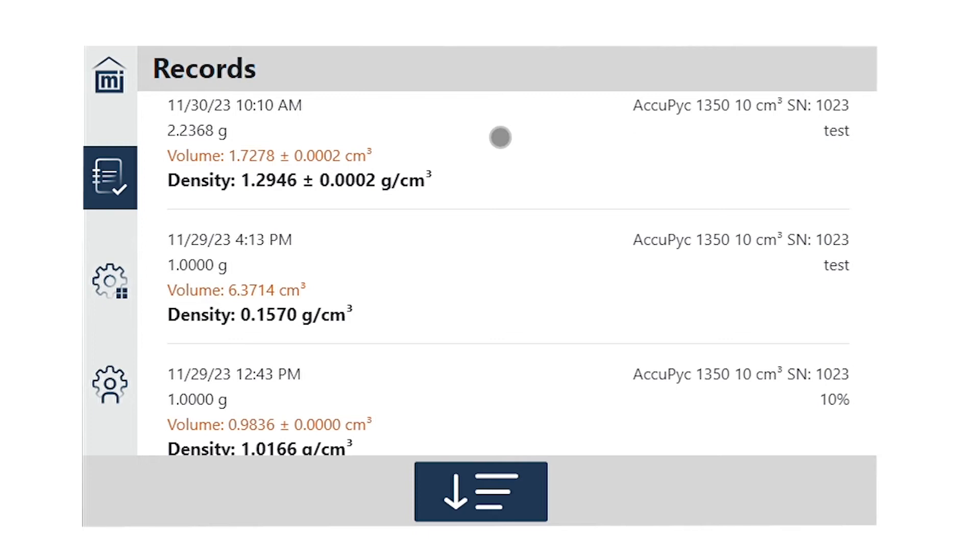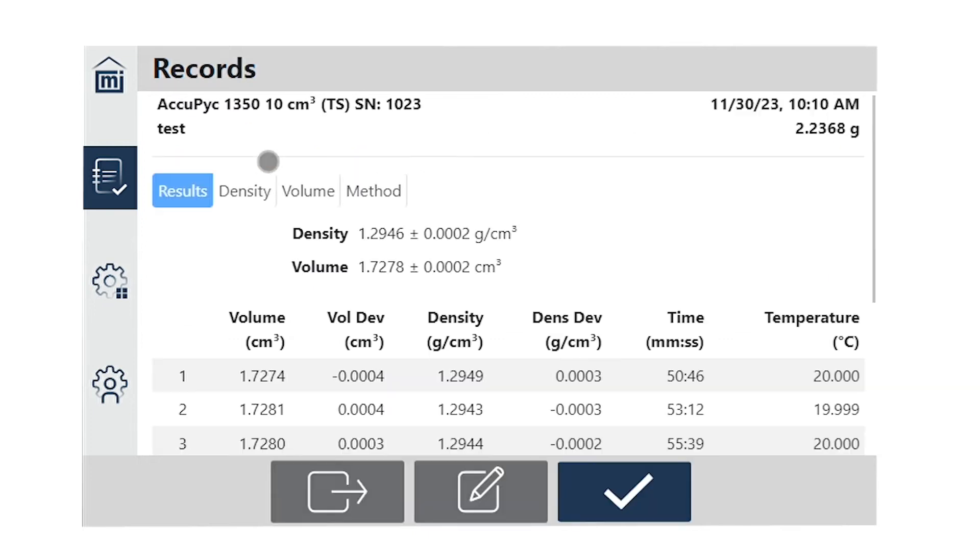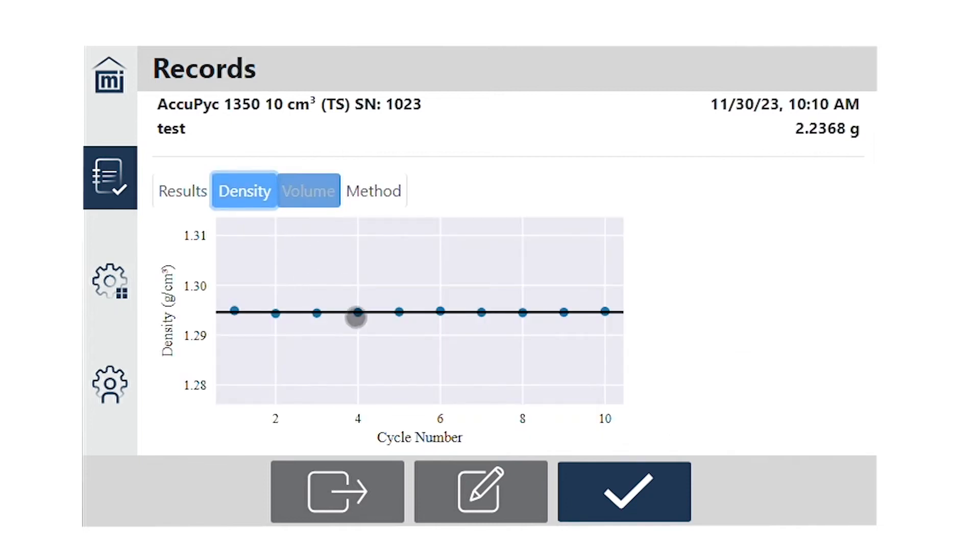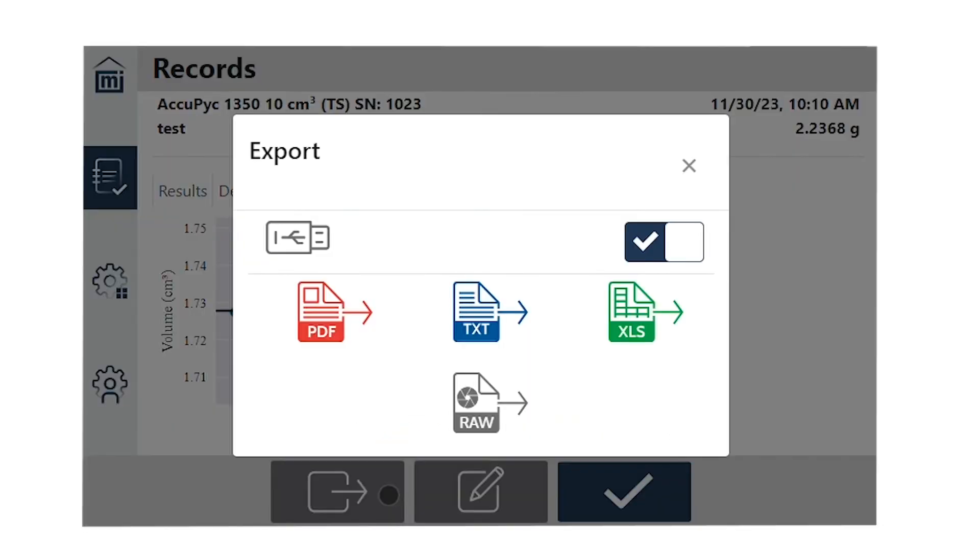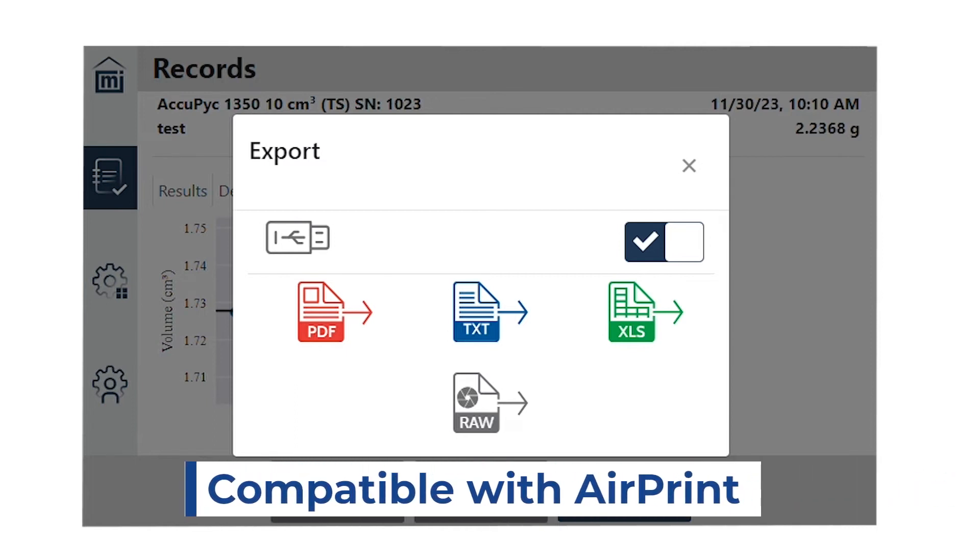Let's look at the data from what we just ran. We can see the data in both tabular and plotted forms. Want to export the data? You can export an Excel sheet, PDF, or print directly to a printer. The AccuPIC is compatible with any AirPrint-compatible printer.